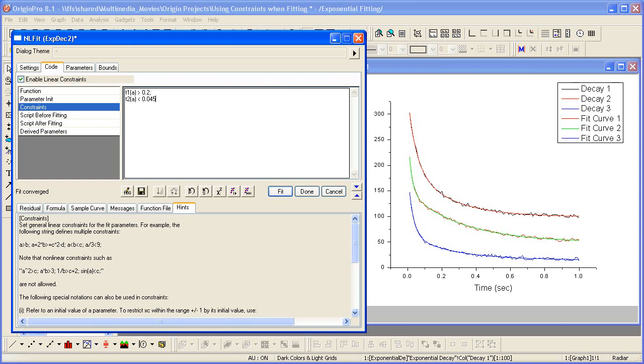When the constraints are entered on a new line like that, you don't actually have to have the semicolon. So we can leave it with or without the semicolon in this case.